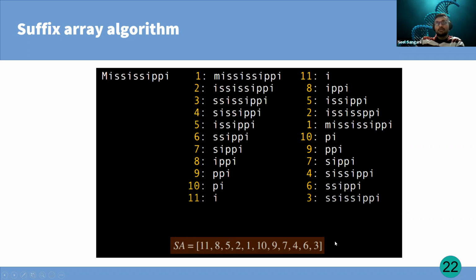But the suffix array also retains the read information, which is the reason why it requires an extensive amount of memory, which usually our local computer doesn't have. That's why most of the time, if you're running this sequencing analysis on your computer, it is recommended to use HISAT2. So that's the general idea and difference between these two.